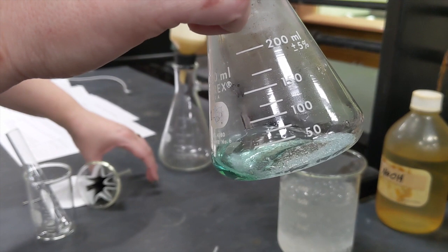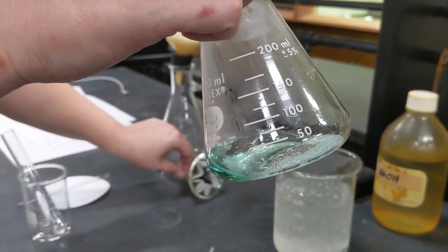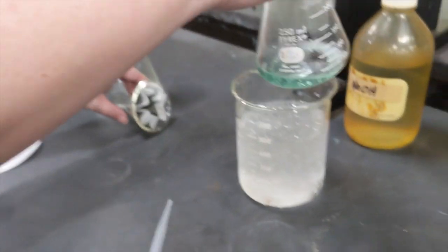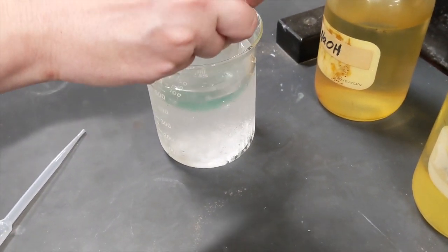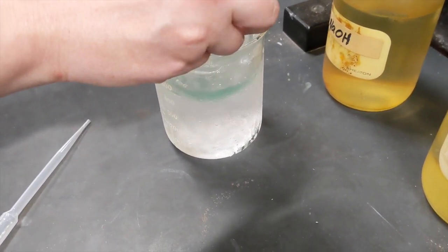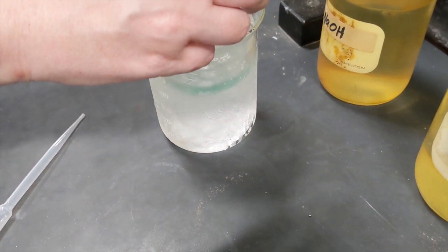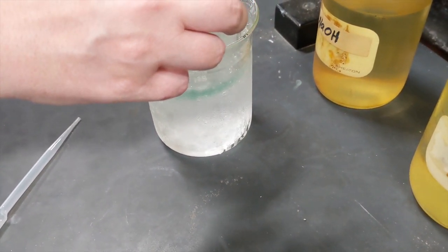To decrease the solubility of iron sulfate, we're going to decrease the temperature of the solution. So we're going to put our Erlenmeyer flask into our ice bath and let it sit here for a little while to get as many crystals out of there as we can.